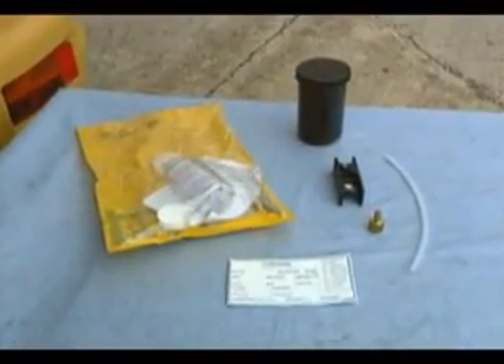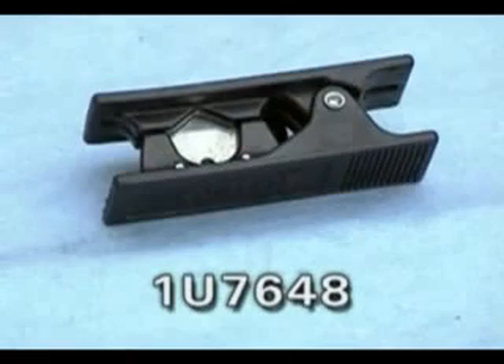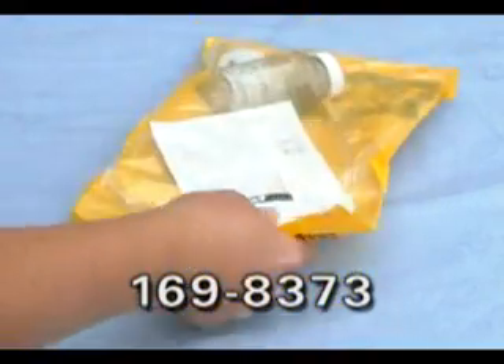Sampling using the sampling valve is the preferred method — it is faster and more reliable than using the vacuum pump. The oil samples should be drawn with a new piece of tubing for each compartment. The tubing should be about six inches long and cut with a tube cutter. You will also need a brass probe to place on the end of the tubing, or you can use the prepackaged bottle, lids, and probe and tube assembly.